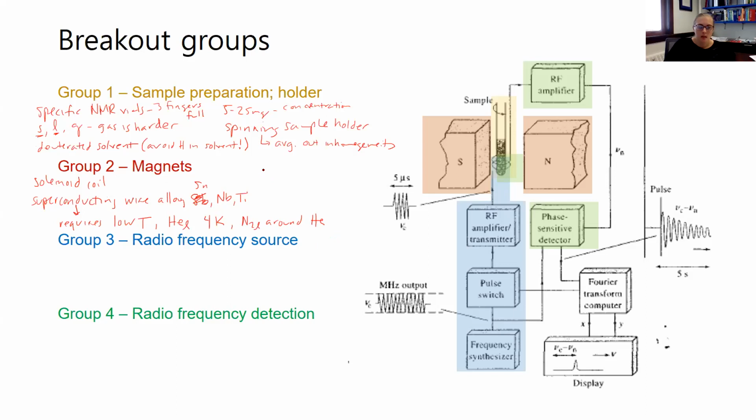Cool. And did you guys read anything about shimming? Oh yeah, actually. So shimming, I guess, is a technique to reduce noise or improve the signal by running another smaller magnetic field, or running a current, I guess to help with interference. Yeah, fine tune that magnetic field. Yeah. So that's an additional complexity. Yeah. That's pretty good coverage.